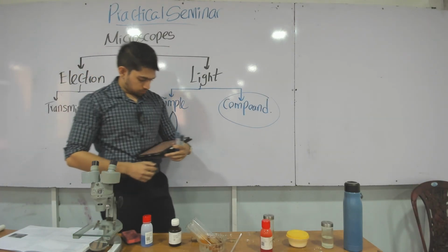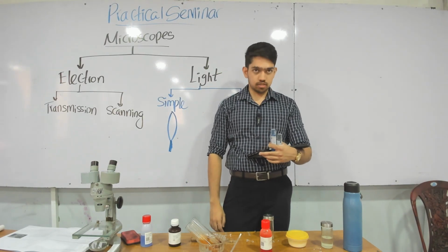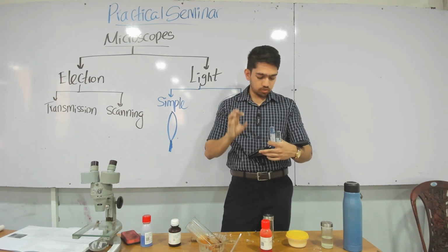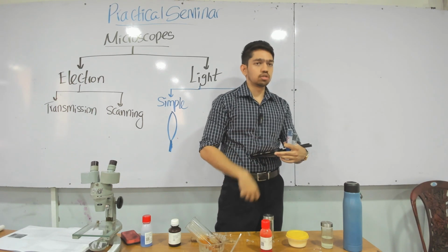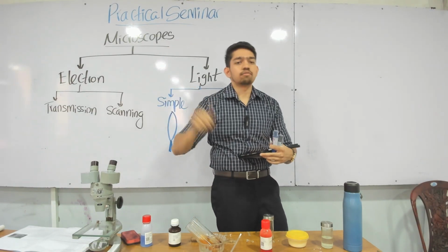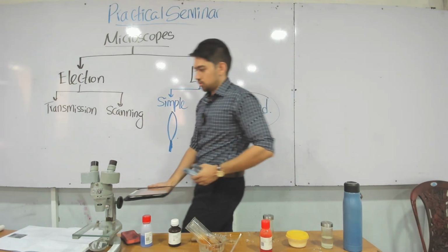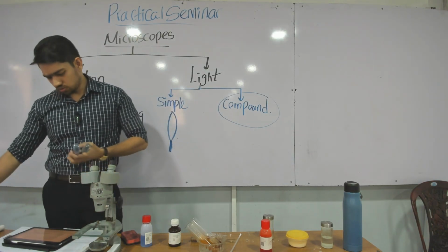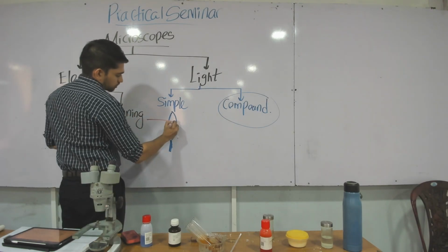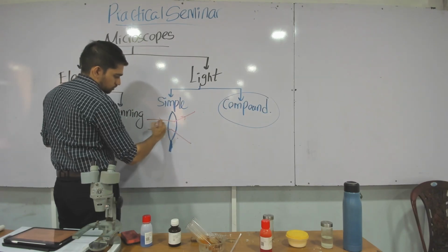Visible under light microscope: visible light is passed through the specimen and then through glass lenses. The lenses refract the light in such a way that the image of the specimen is magnified as it is projected into the eye. The image is magnified by bending light waves. Because when light reaches this glass lens, I think you know this better than me, from physics, right? Whenever light reaches this, it is going to be bent, and it bends on refraction.